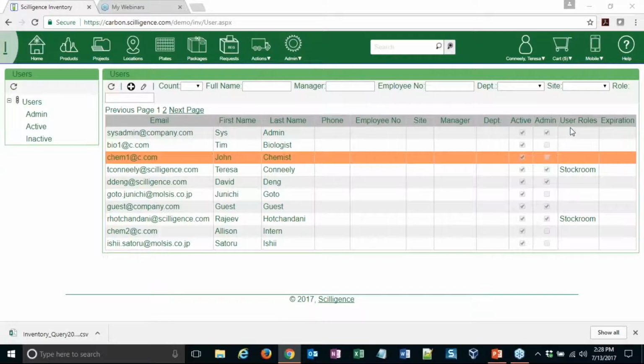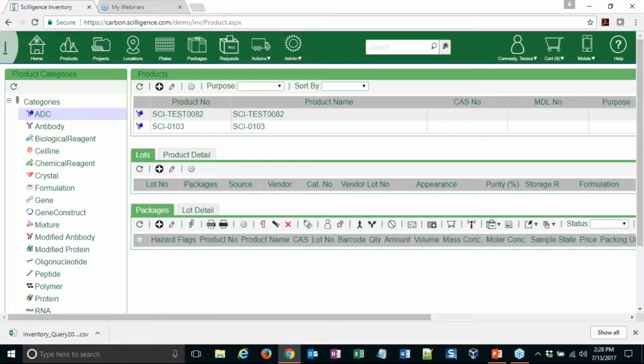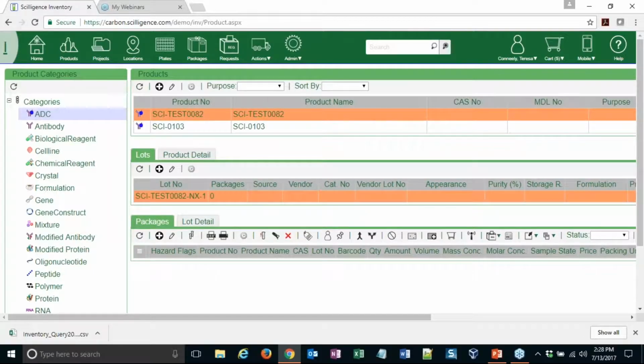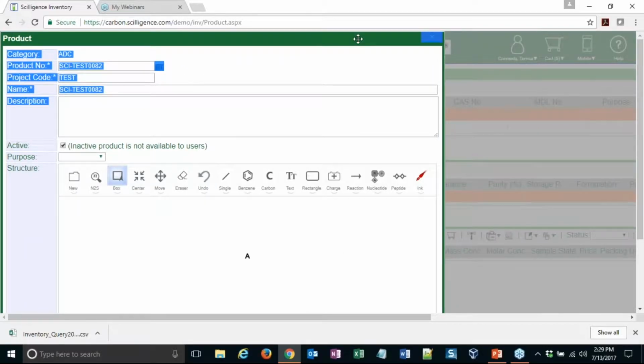Can your product register antibody drug conjugates? Yes. Under ADC, we have the antibody drug conjugates. I'll just see if there's any information in here, I haven't looked at this in a while. No. So you can register the same way that we say in the small molecule, and your 3 parts, the antibody, the small molecule will carry over, the linker will carry over.